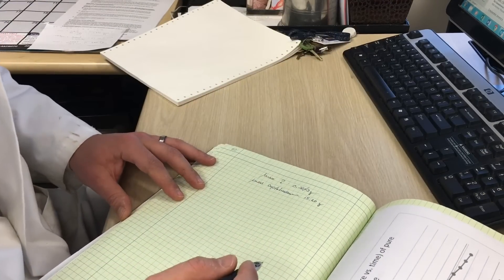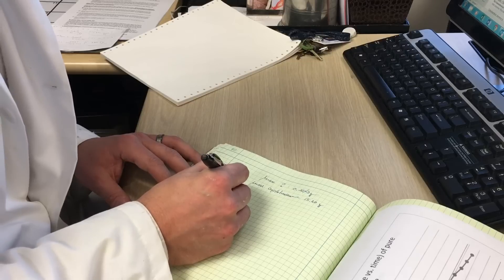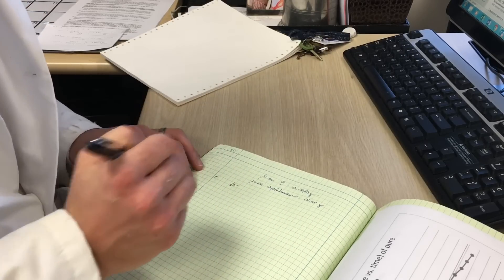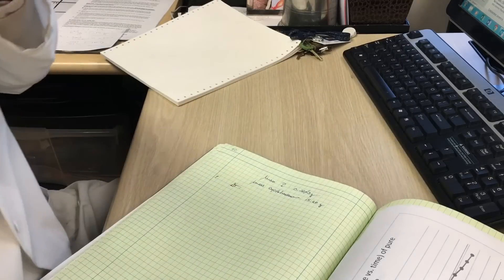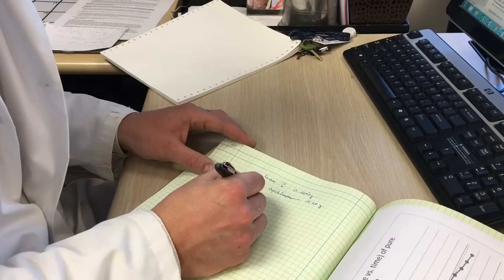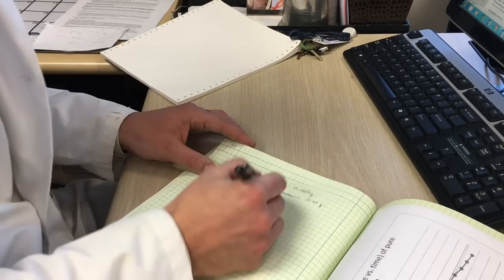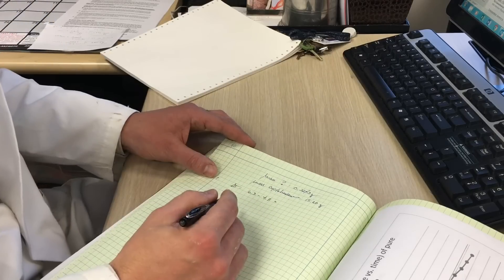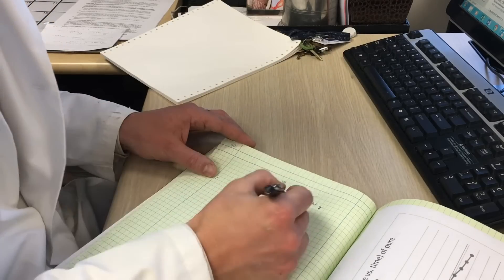We can begin by calculating the change in temperature. This will be our first calculation, freezing point depression. Originally was at 6.3 and then 4.7. So we have a freezing point depression of 1.6 degrees Celsius.